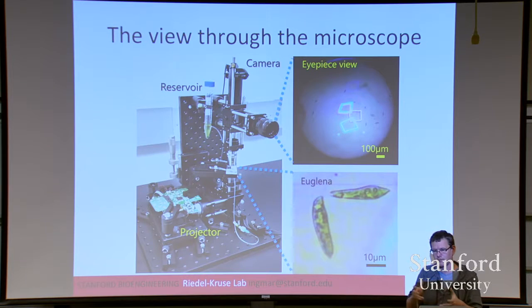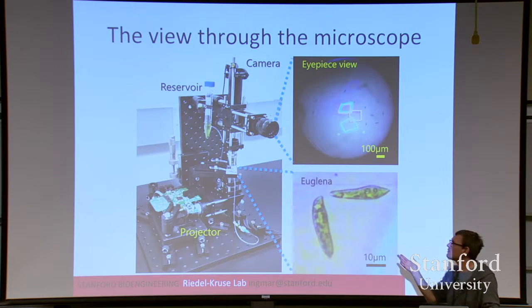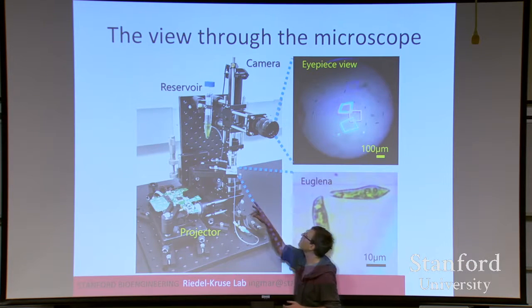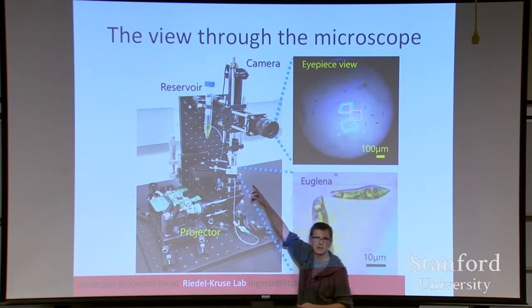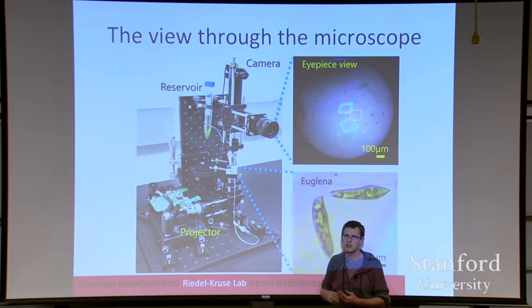Like we are very used from our computers. We can turn them on and off, and this works for years. So with these systems, we know that on a couple of weeks time scale, the system works well, and then we have to exchange all the organisms. In part, I mean, when I say exchange, we have to exchange them there, but we exchange them much more frequently, every couple of hours or so inside the chamber, right?